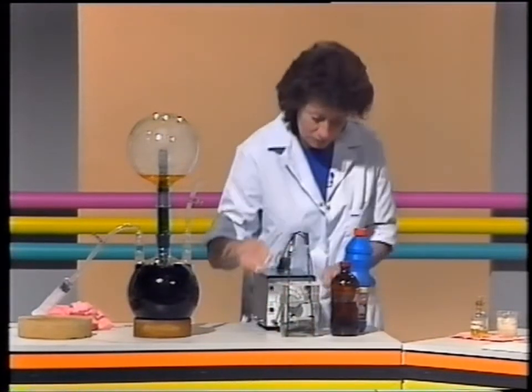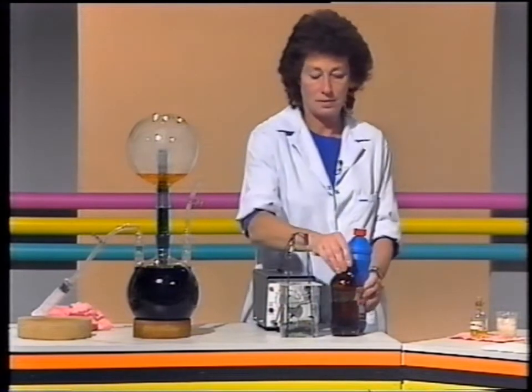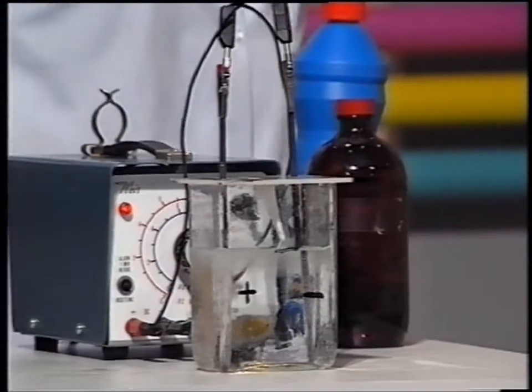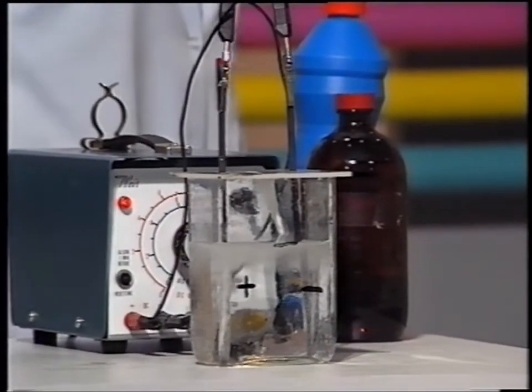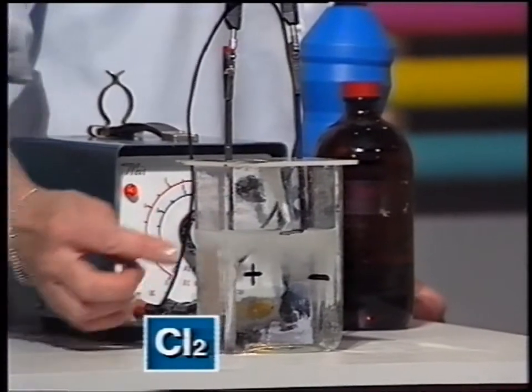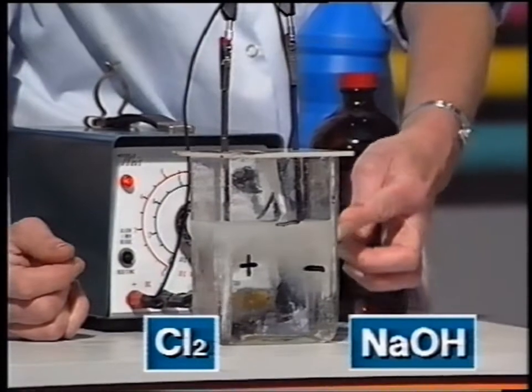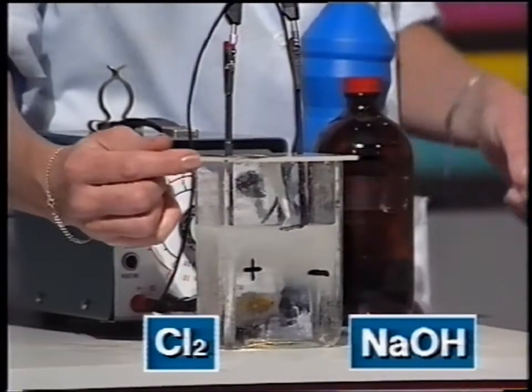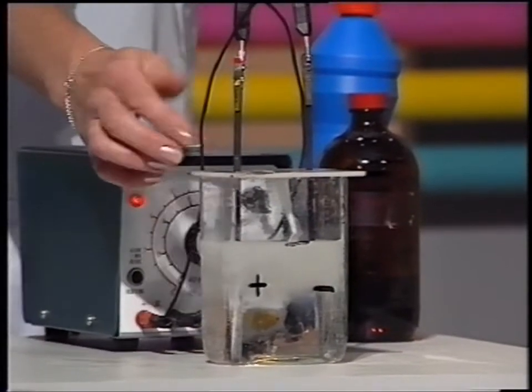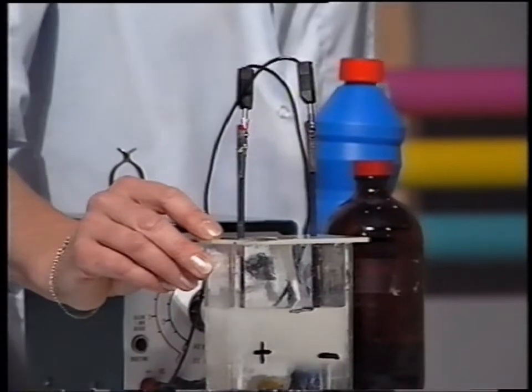It's also possible to extract other useful chemicals from sodium chloride by a process of electrolysis. And here we've got an electrolysis cell, which is similar to the one that's used in industry, but scaled down. At one electrode, we're producing chlorine gas, and at the other electrode, sodium hydroxide will be produced. Eventually the chlorine gas will come into the space above the two electrodes and it will colour the litmus indicator. It'll change it from blue to red and eventually bleach it.